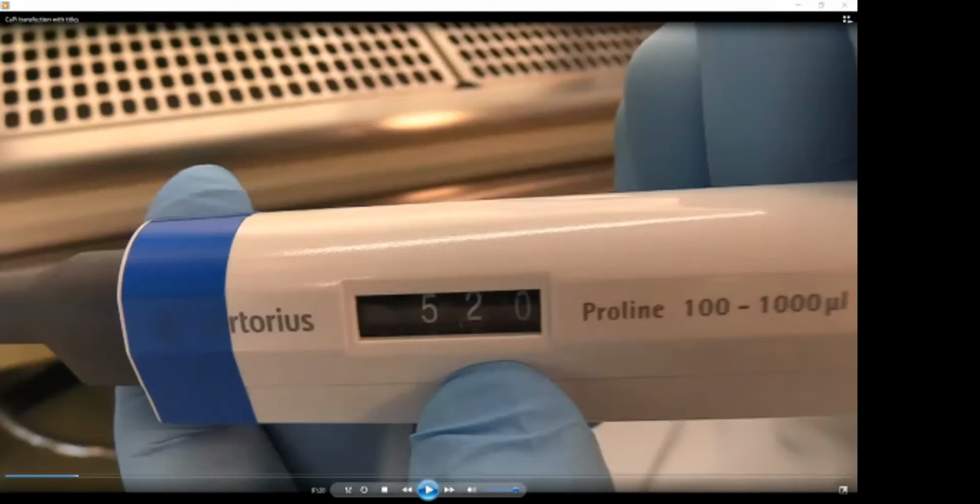When we have 12 samples, because it's 4 different samples times 3 is 12, we have to prepare solutions for 13. Why 13? Because these pipettes are not very accurate, and therefore it's always useful to have one as a backup sample. So we are calculating everything for 13 samples.